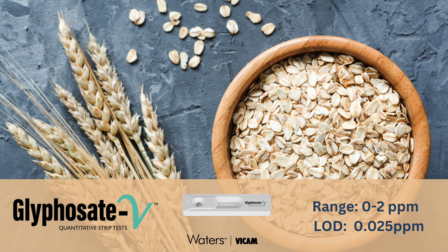BICAM's Glyphosate V Lateral Flow Strip Test measures total glyphosate concentrations in water and cereal grain samples in less than 15 minutes. The test is designed for field and laboratory use and requires no special training or expertise to obtain accurate, precise results. In this video, we'll demonstrate the quantitative glyphosate V procedure for cereal grain samples.